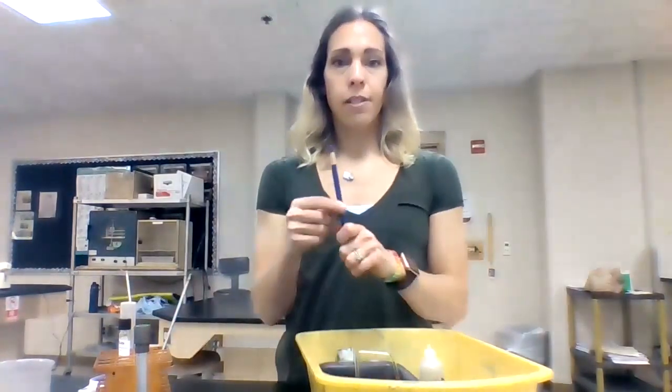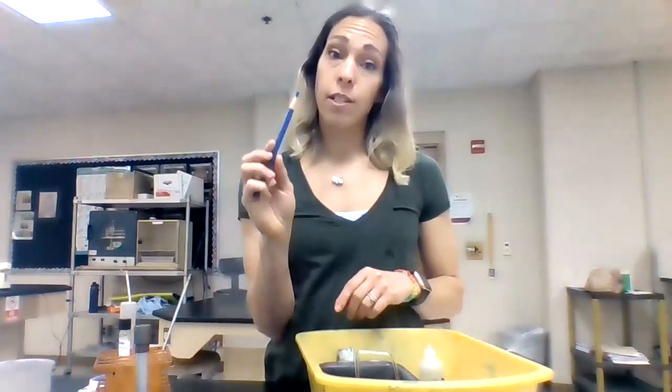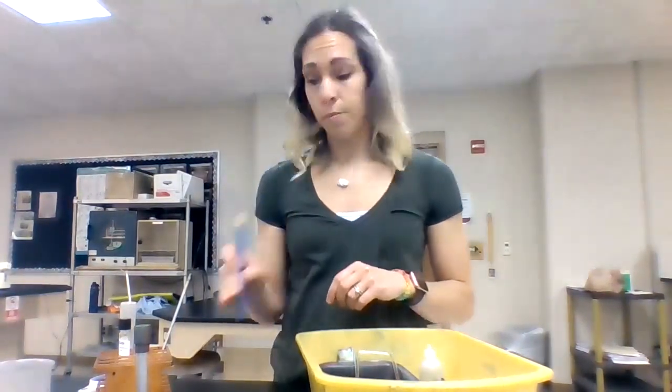Next thing you probably have is a wax pencil. This is how we write on our slides and this is how we write on our test tubes.